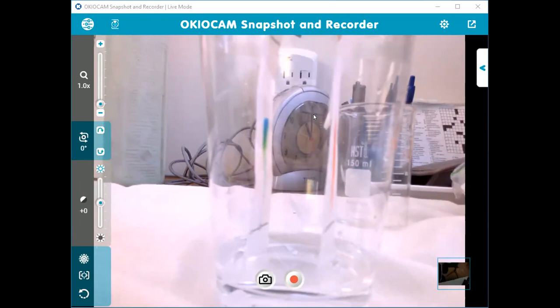So I'm going to show you the actual water lines on here. This is the actual water line that you need to mark, for all of these. You can see that for all of these examples, the actual water line is not the same as the finish line that I had originally marked, those pencil marks.